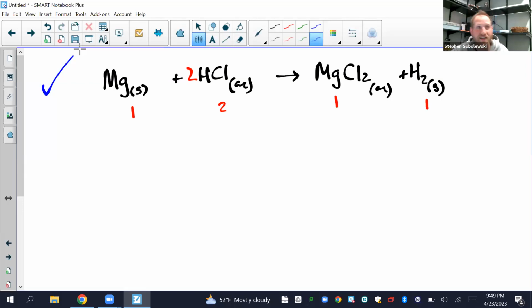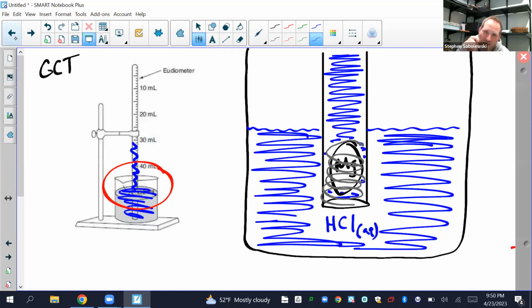First of all, it's a liquid. Second, it would cause severe brain damage long term. That's out. I would love to be able to use gold, silver, or platinum, but we don't have an infinite budget. So what's the best choice? Copper. By taking advantage of the activity series, we're going to wrap our magnesium in copper wire so the copper doesn't react, but the magnesium does.